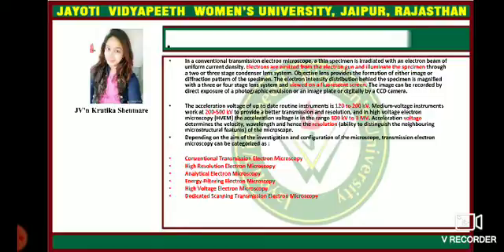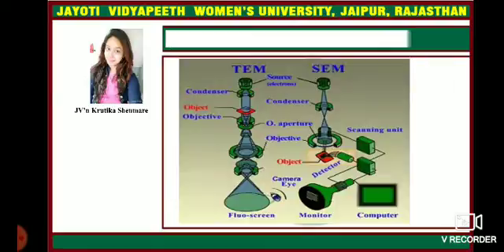Depending on the aim of the investigation and configuration of the microscope, transmission electron microscopy can be classified as conventional transmission electron microscopy, high resolution electron microscopy, analytical electron microscopy, energy filtering electron microscopy, high voltage electron microscopy, and dedicated scanning transmission electron microscopy.